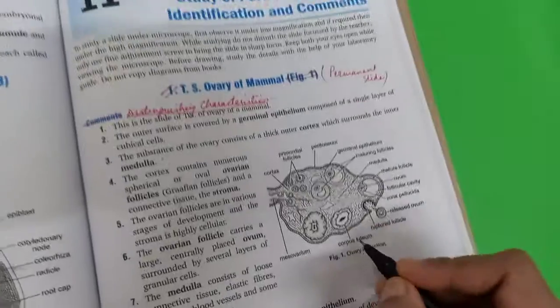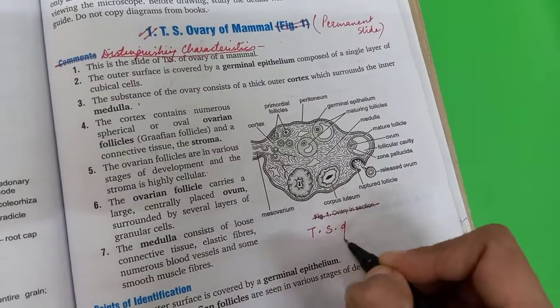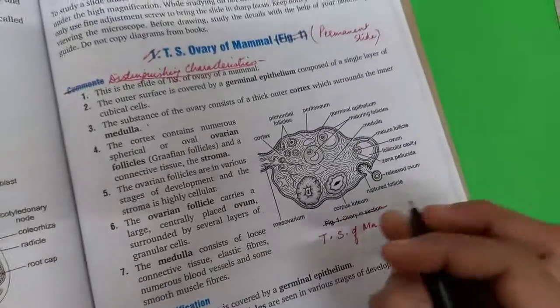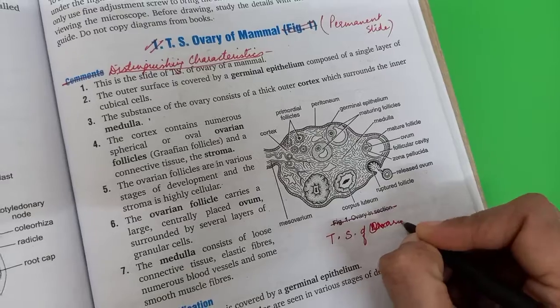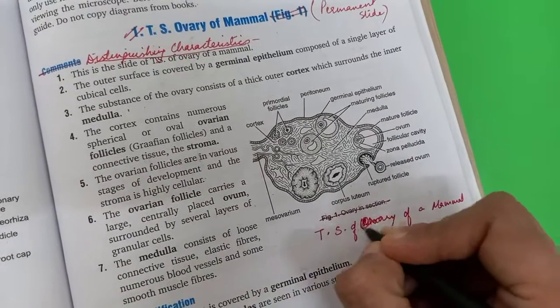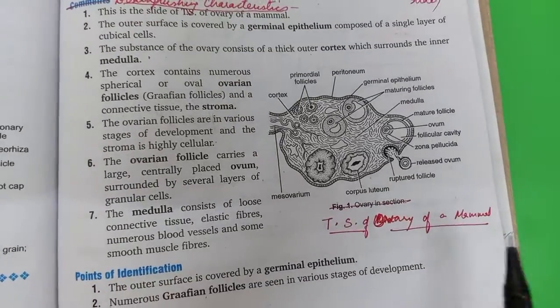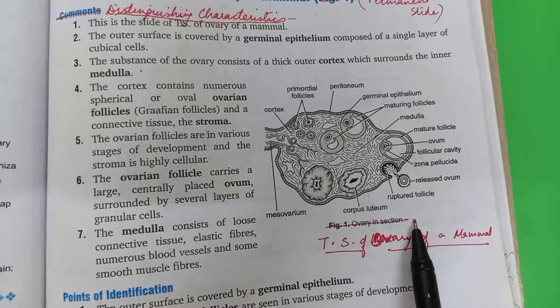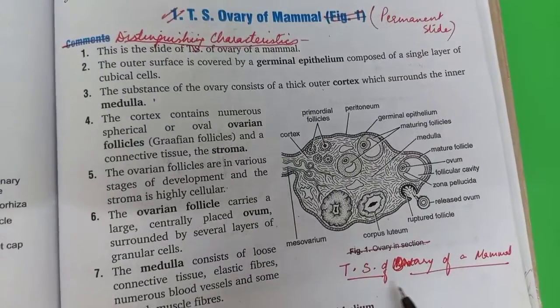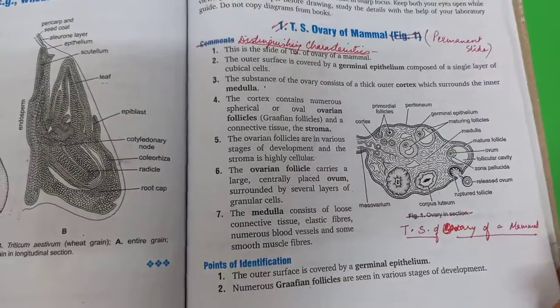It is the ovarian section, but you will write the heading TS of mammalian ovary or TS of ovary of a mammal, because section alone does not specify which section, right? So make sure that this is TS or the transverse section. No figure number required. So that's all for your work just now, children.